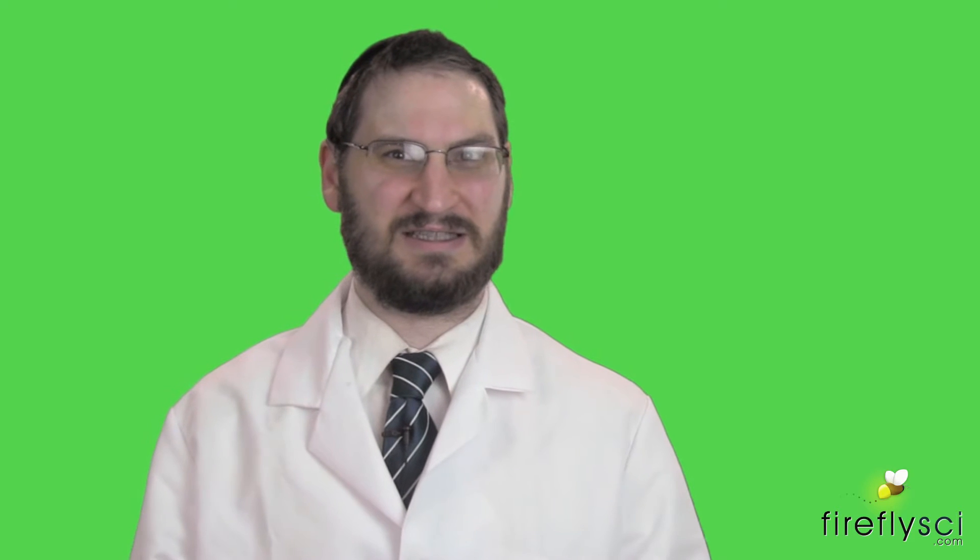Hi everyone! This is Simcoe Waitovic from FireflySci. Today we're going to take a look at how to set up Type 20 and Type 19 demountable cuvettes. We're going to go over how to inject the sample, assemble, mount, and clean these cuvettes. So let's jump right in.